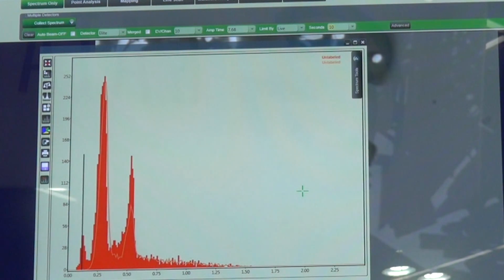We're really talking about nanometer depth here. If I have a dirty sample with carbon on top, I'm not going to see silicon, I'm only going to see carbon. As we move down into low energy spectra and mapping, cleanliness becomes very, very important.